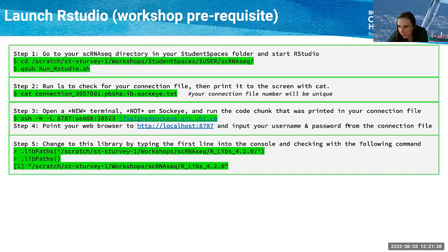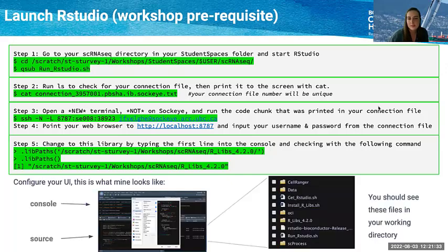Good. And then feel free to configure RStudio how it best suits you. This is how I do mine. People might feel a little flipped around: my console is on the top, my source is on the bottom. If it's easier for you to do it that way to follow along, do it. If you're more comfortable having the source on top and the console on the bottom, feel free to keep it that way. Just know that mine's flipped. All right.